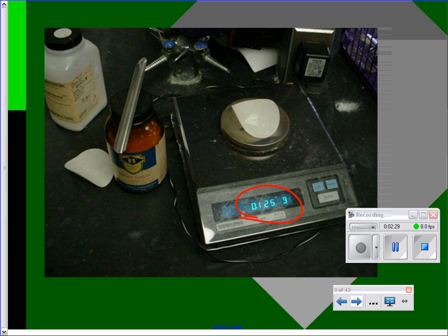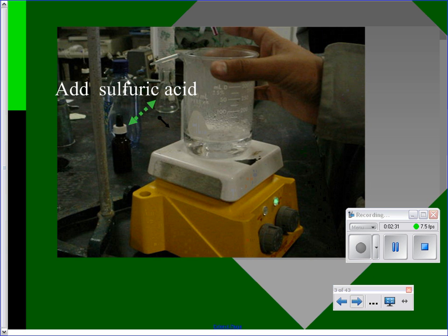You're going to write down in your data table how much sodium oxalate, and you're going to dissolve it in some water. This is not super crucial, exactly how much water, just enough to get it dissolved. Then you're going to add sulfuric acid. This is the big one here because it's a redox titration. And what did I say? You're going to balance it in what? An acidified solution. So redox won't happen if you don't add the sulfuric acid. Currently, this is under the fume hood, and you're going to use pipettes to fill your little graduated cylinders up. Okay?